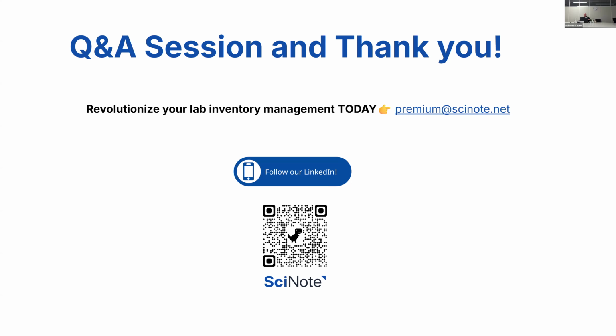In the meantime, we got a few more questions, and then we're going to finish off. So Musa, yes, you will receive copies of this presentation, and you can use them in the future. And can SciNote remind us to take samples from customers on a specific date? Yeah, Andreas, you can set this up with reminders. You set up reminders, and then a specific person will get notified, hey, you need to get the sample from the customer.